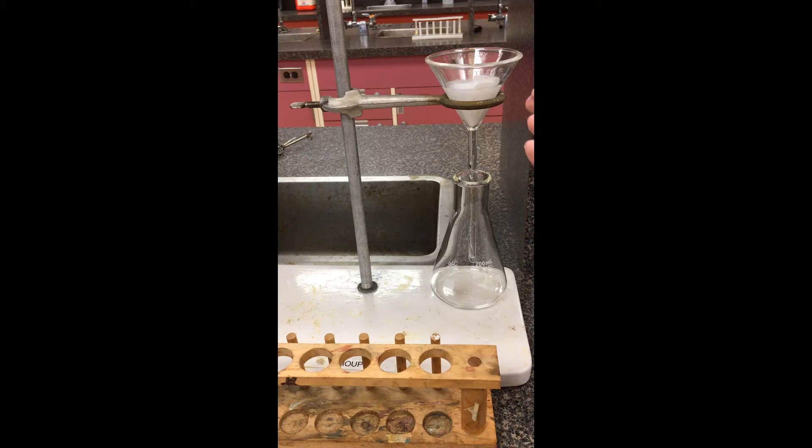So we just fast forward. We're going to imagine all the liquid just gets all the way through. The filter paper along with the solid here will still be fairly wet. So you're going to leave it for a little while, let all the water evaporate off. You can then pull the filter paper off and just put it on a mass balance. Compare it to the mass of just the filter paper by itself, and there you get the mass of the residue.